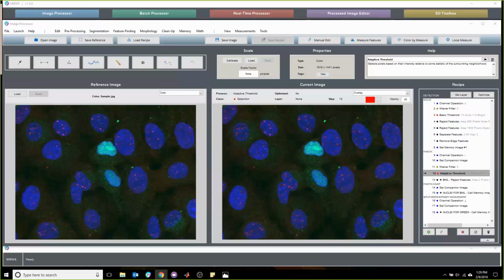Yeah, that's really exciting to us to hear. I mean, down the road, we see MIPAR potentially being able to bring in some of those data analytics tools and being able to generate these neural networks itself from the microstructural data that it pulls out. And if we get to that point, your input on how you do that today and ways that could be improved would be really awesome to hear. But it's great to see you making such good use of the data today. Yep. So thanks again so much for joining and being willing to share.